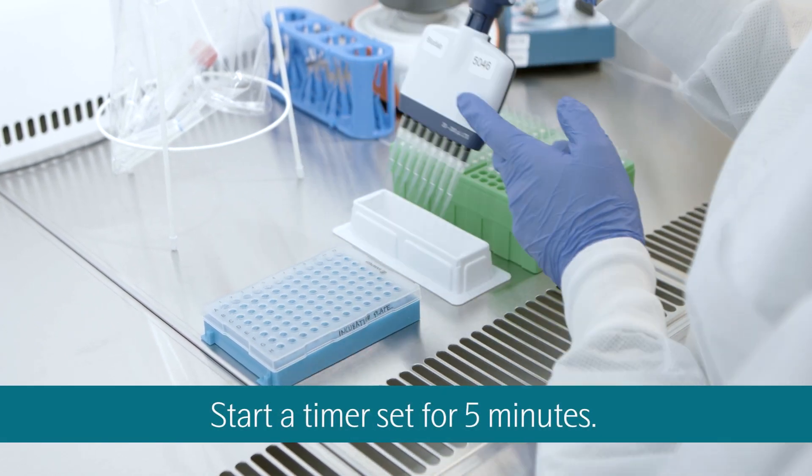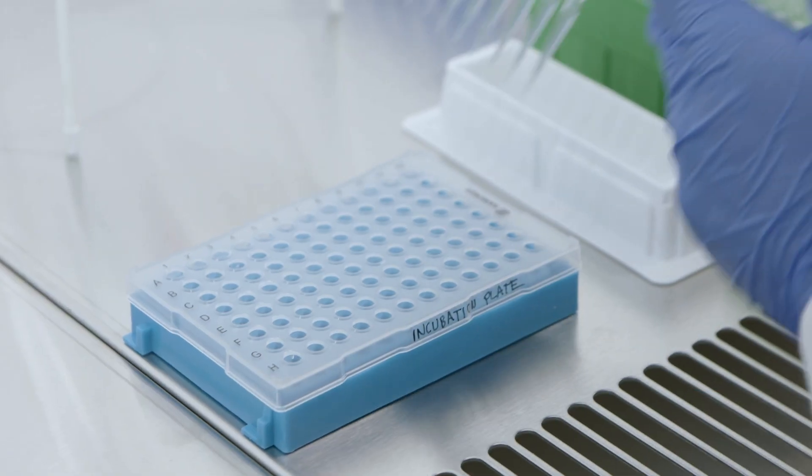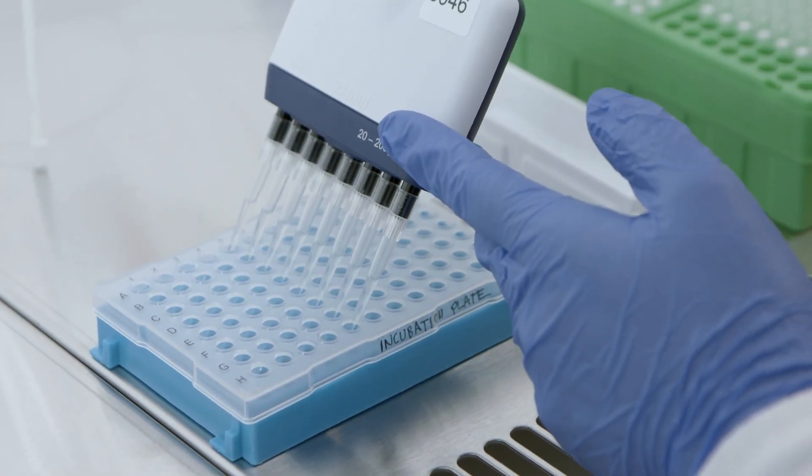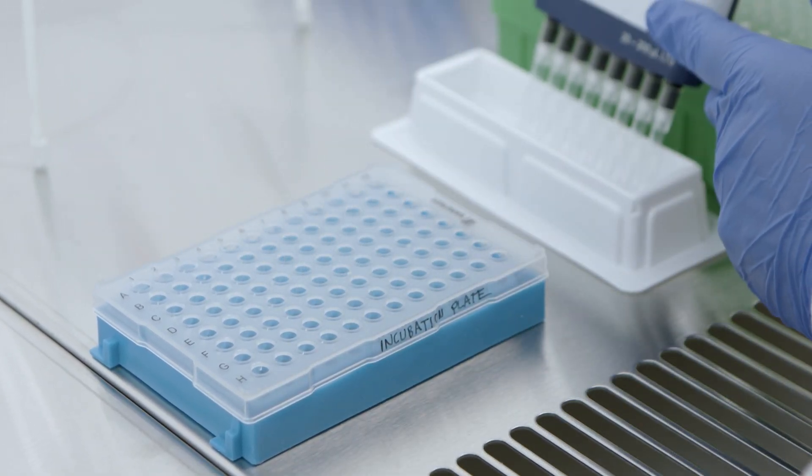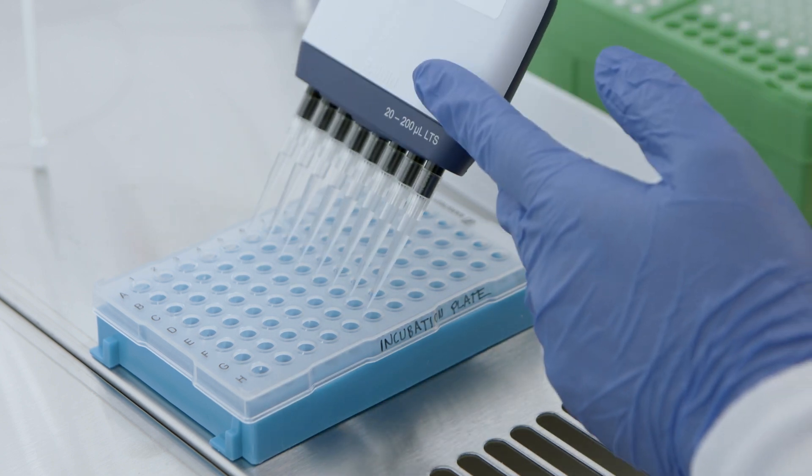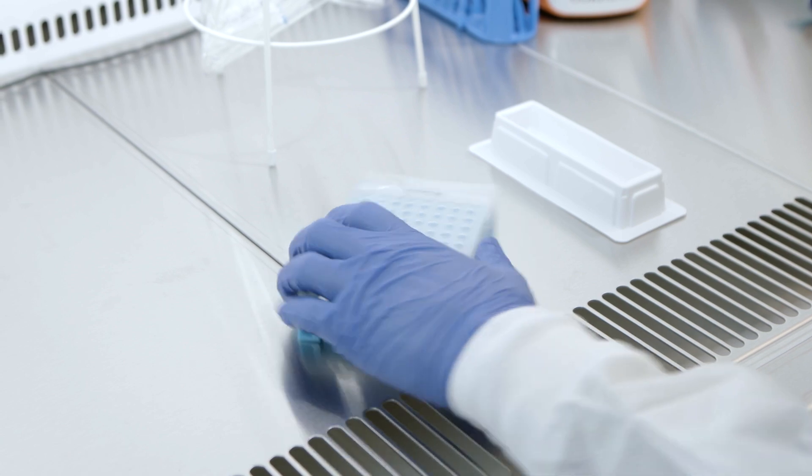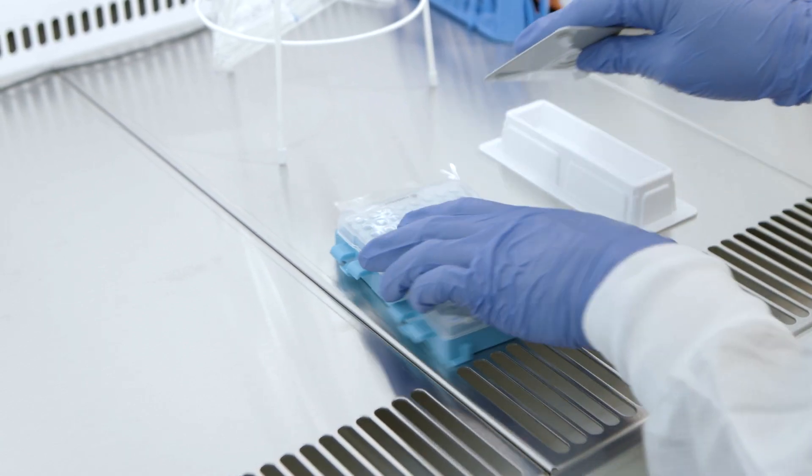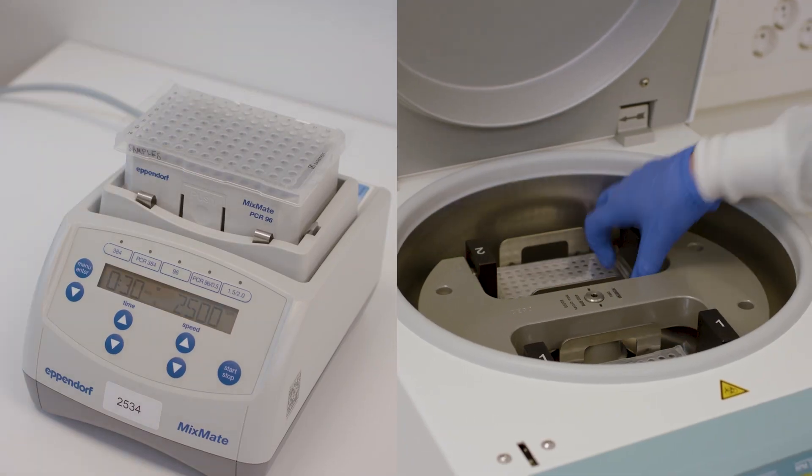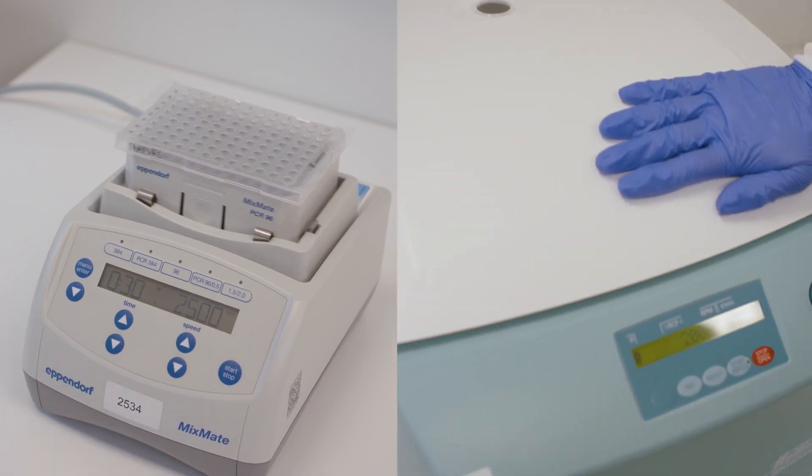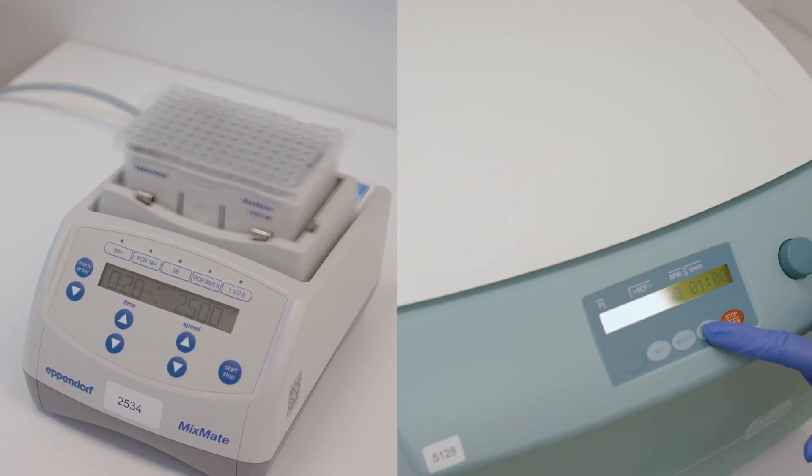Start a timer set for 5 minutes and transfer 96 microliters of extension mix to the incubation plate using reverse pipetting. Seal the plate with a new adhesive plastic film and vortex thoroughly to ensure all wells are mixed before spinning it down for use in the next step.